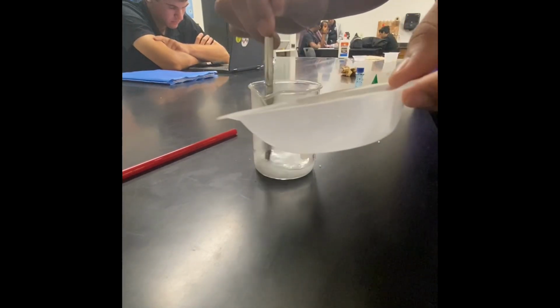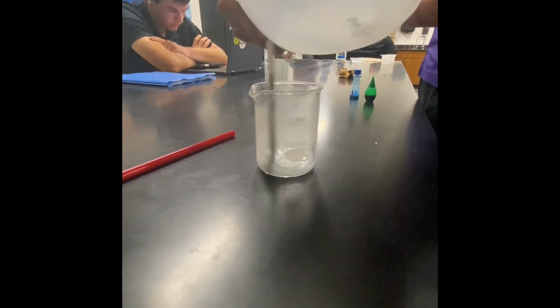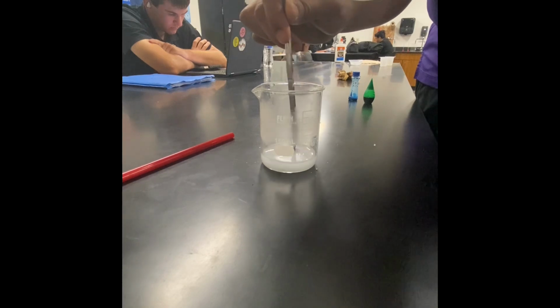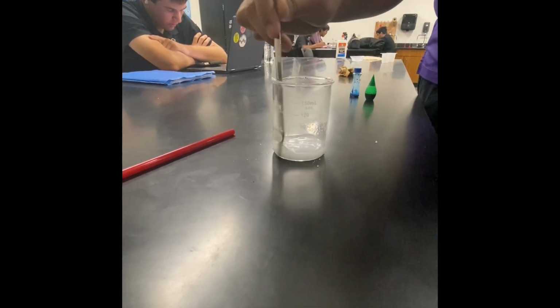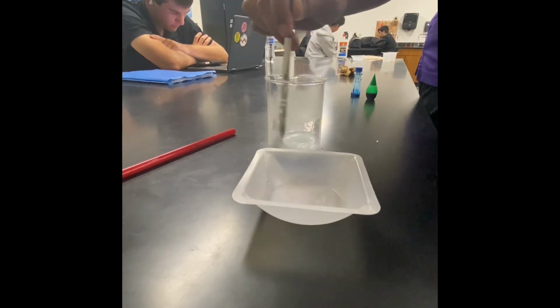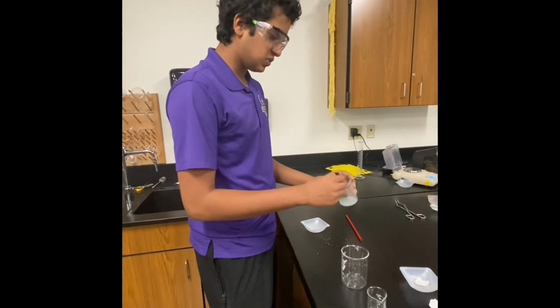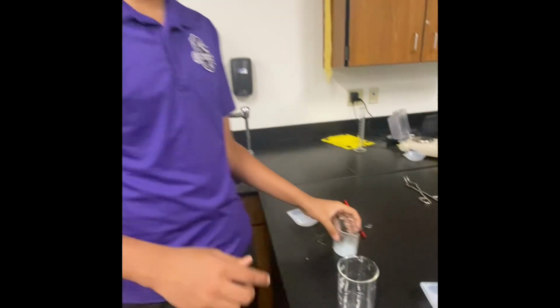As we keep mixing, we want it to become a solution. Here we go. And here's the last one. We'll let it rest while the solution is still hot, and as we see, there's still a little bit to be dissolved here, but that's not really a problem as we put in the food coloring.